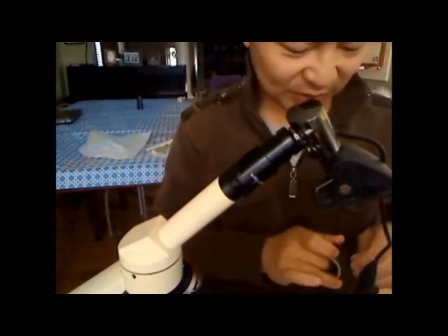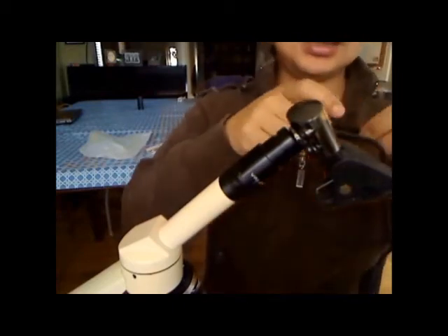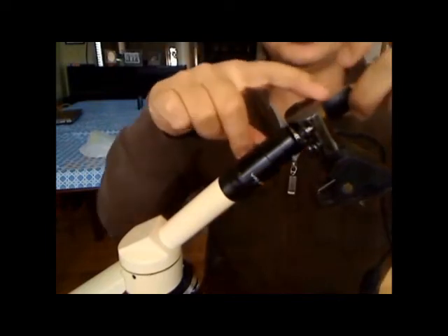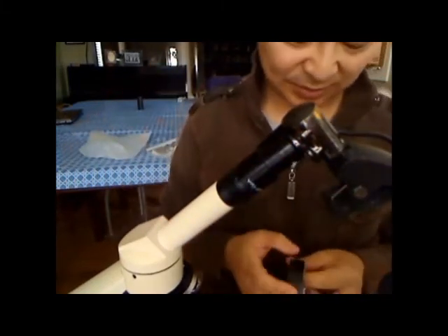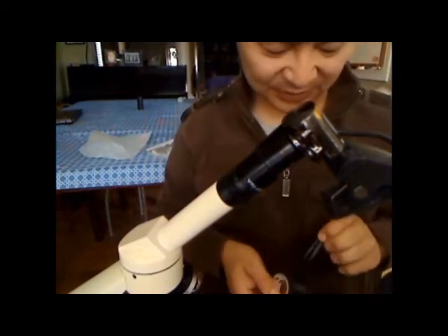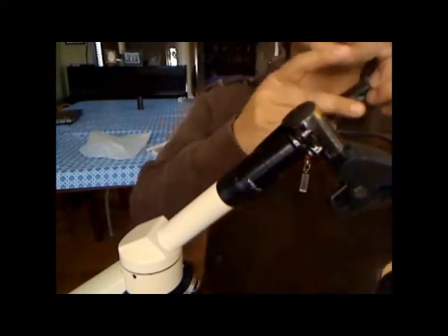I'm going to show you what it looks like under the microscope. I have a corn root sample we're going to look at. We'll zoom in at low, medium, and high power. You don't have to have fancy software — any software that comes with the camera will be sufficient.